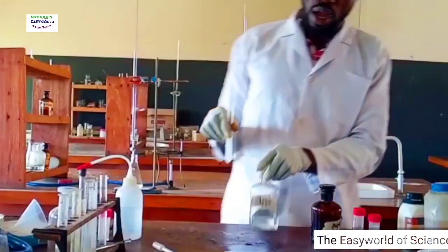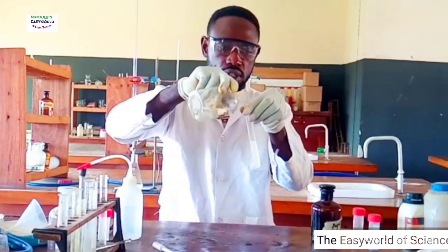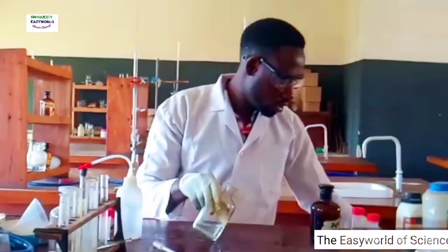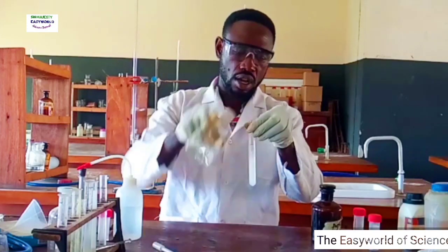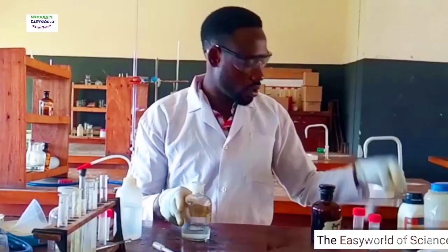This is another aqueous ammonia. Okay, there is much of the ion. That's the problem.